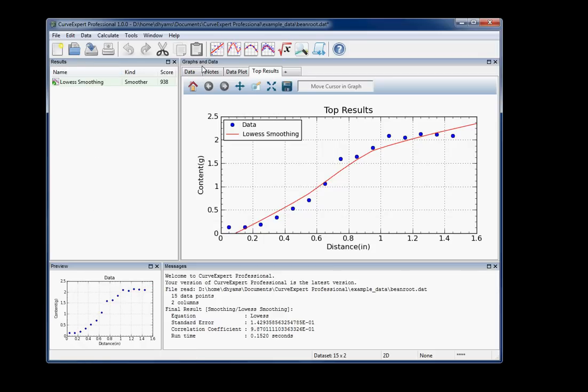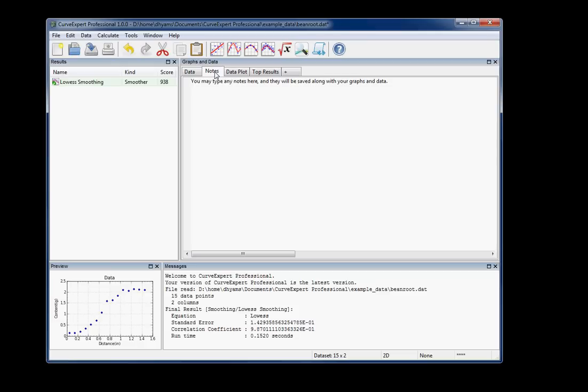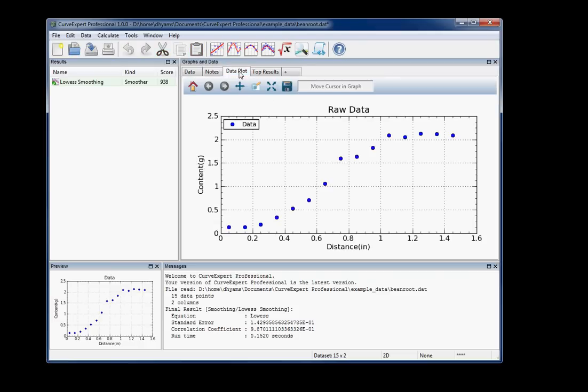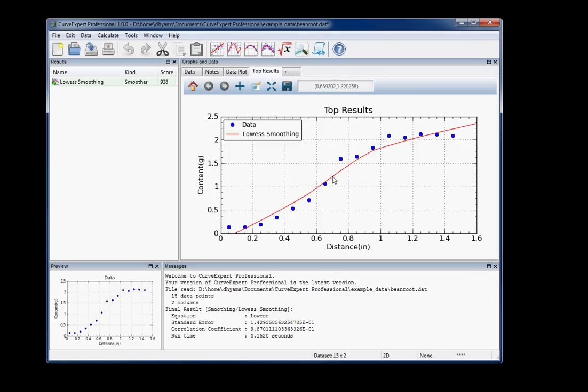In the Graphs and Data pane, you have, of course, your spreadsheet, some notes that you can type and save along with your data if you choose to save a CurveExpert file. You have just the data as a plot, and then you have a top results plot, which basically shows you selected results from the batches of calculations that you've done.